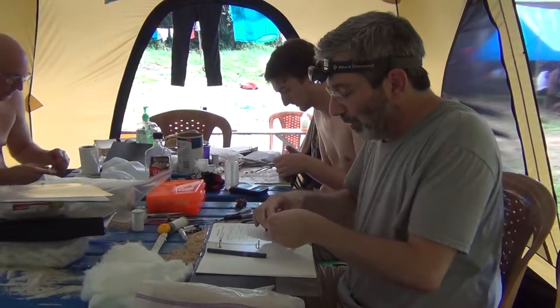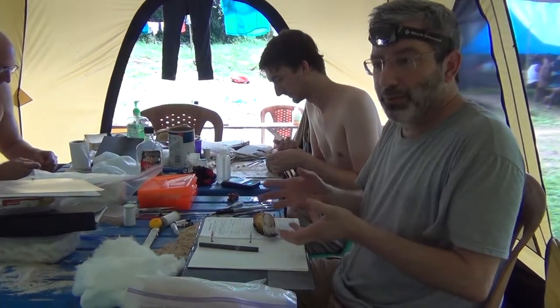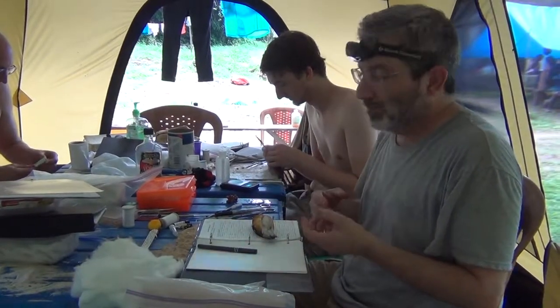I'm going to prepare this bird as a study skin. I'm simply going to remove all of the soft parts — all of the muscle, all of the guts — and I'm going to replace them with cotton.